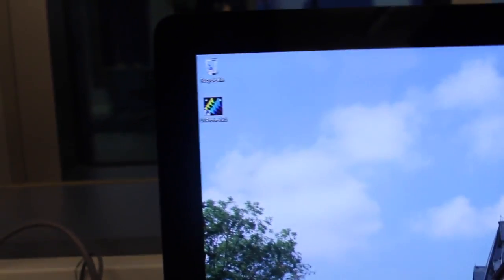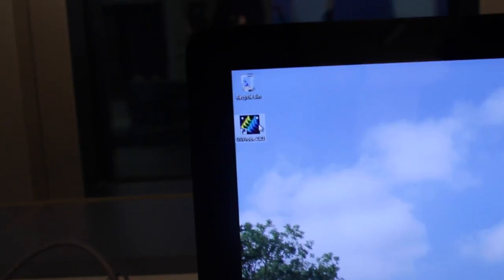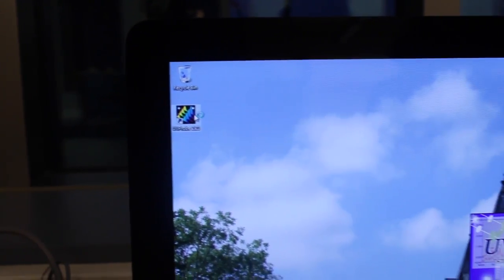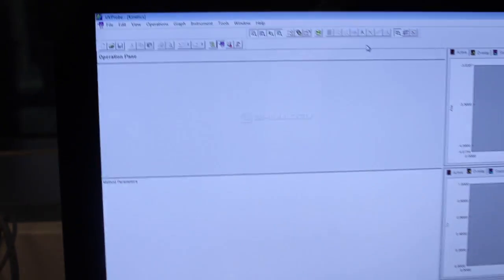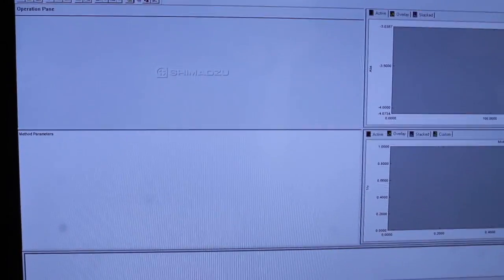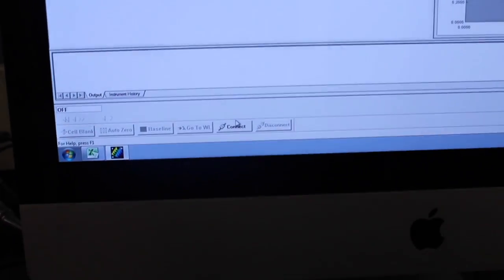While it is initializing, open up the program UV Probe 2.21 on your computer. You will then click on the connect button on the bottom left-hand corner of the screen.